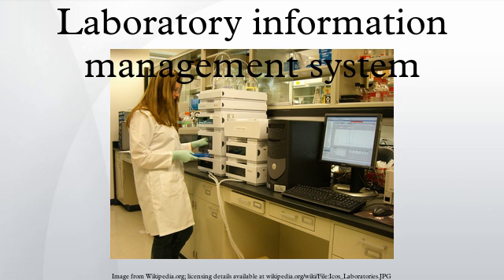Client-side options. LIMS has utilized many architectures and distribution models over the years. As technology has changed, how LIMS is installed, managed, and utilized has also changed with it. The following represents architectures which have been utilized at one point or another.